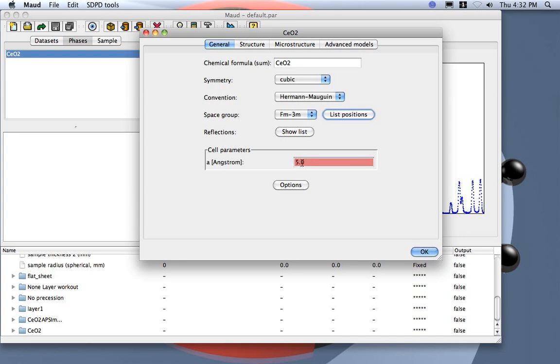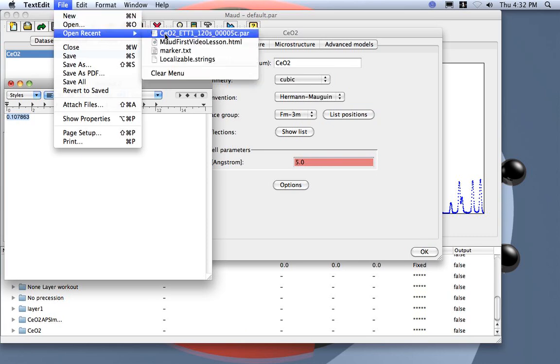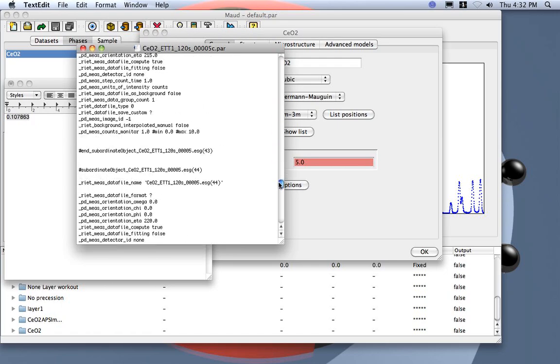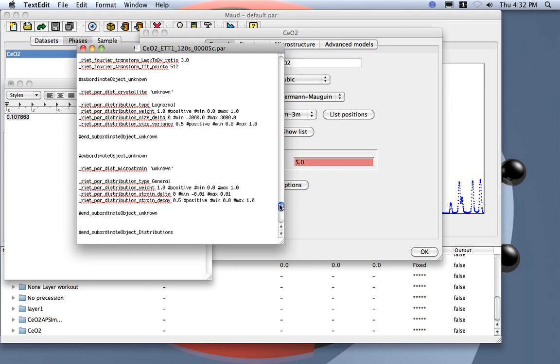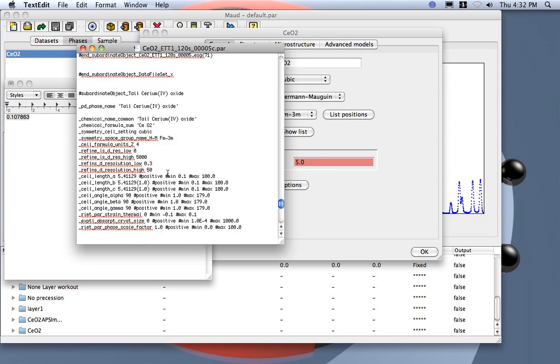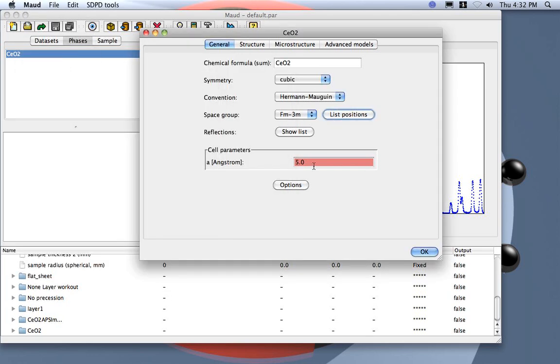I need the cell parameter. This will be my standard, and as a standard I will not refine the cell parameter — I will set it as I already know it. Here is the set parameter.